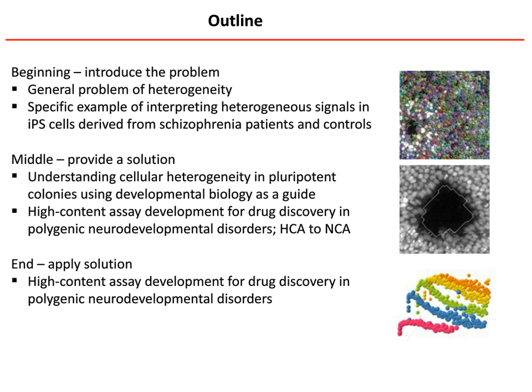My intent in presenting this work is to extend our perspective on high content analysis beyond the single cell toward relationships between cells, but using existing technology that is currently applied to high content analysis.